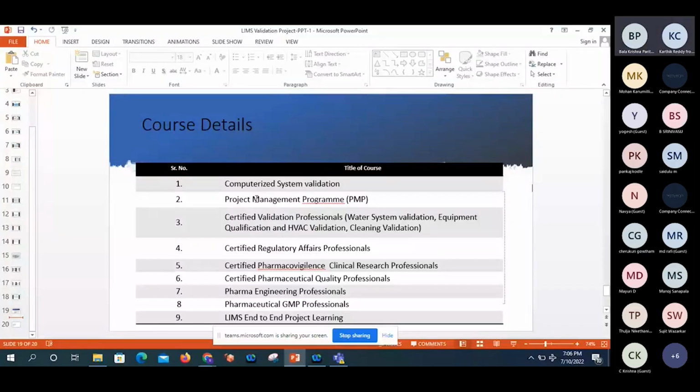Which LIMS you are using? Caliber LIMS, sir. Version 3.2.1, sir. So is it happening repeatedly or only in some cases? Repeated, sir. There is no automatic date updation.